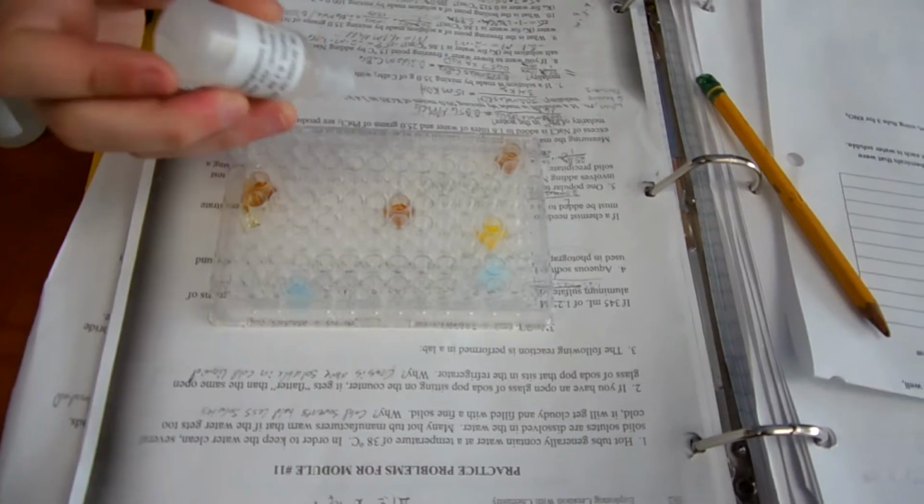Okay, that's enough. We saw it. So definitely a precipitate, white lead hydroxide. Same white precipitate we keep seeing. That's my kid. Oh. Okay, so I'm fine. Probably I'm fine.